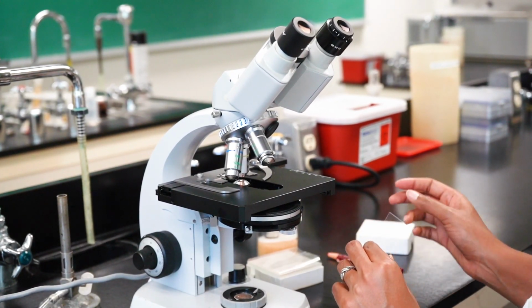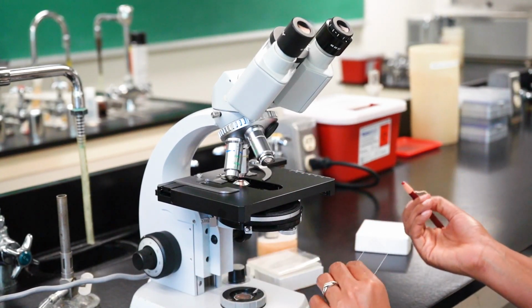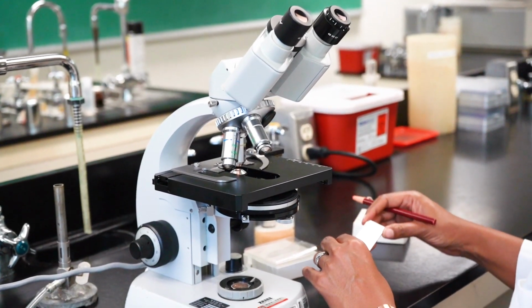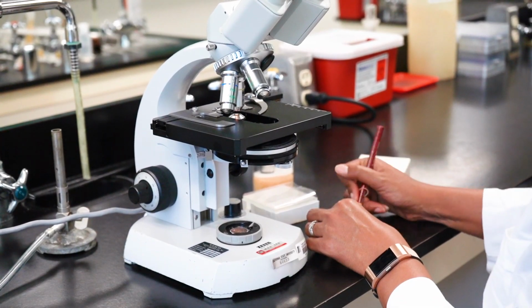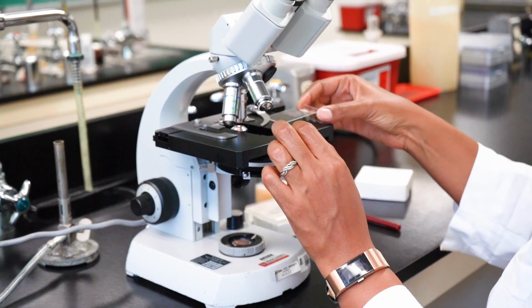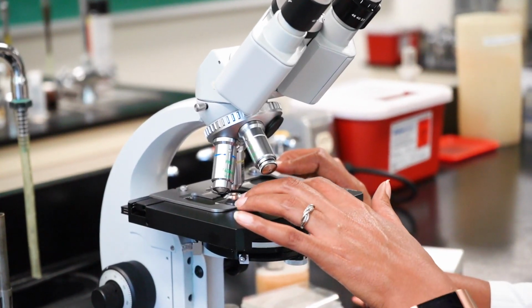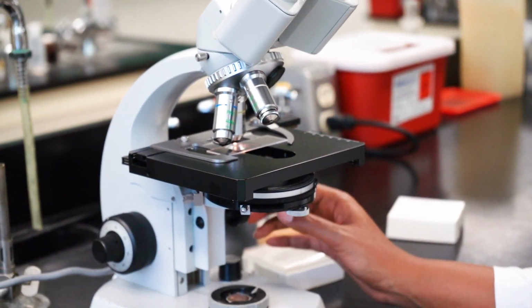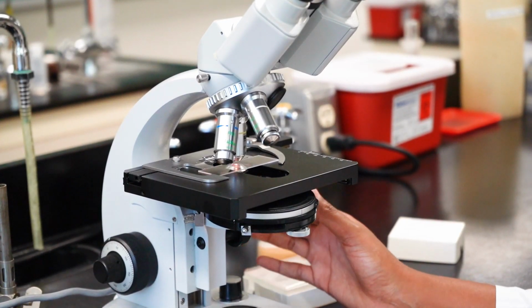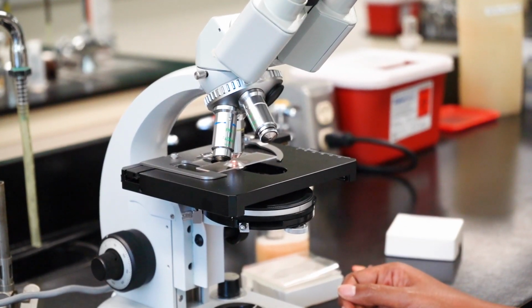So the first thing you want to do is take a clean glass microscope slide and mark it with a wax letter, preferably one that looks different when it's upside down or backwards. I prefer the letter R, but there are other letters that would fill this role. You can then push back the stage clip here and slide your wax letter R into the specimen holder, and then move the wax letter so that the wax is between the condenser and the objective.